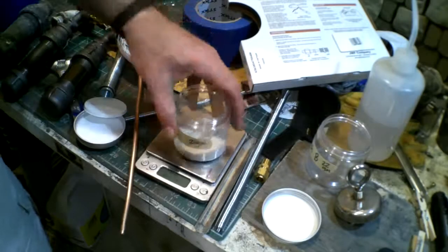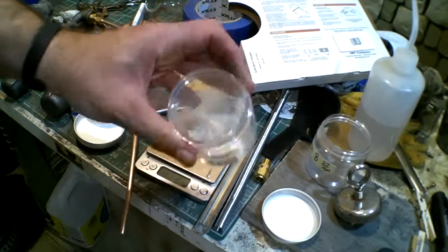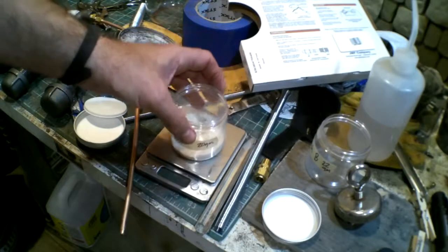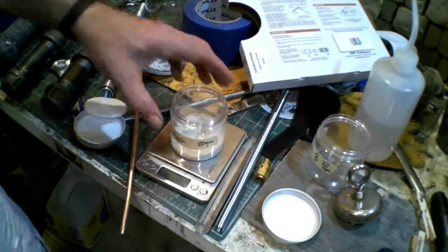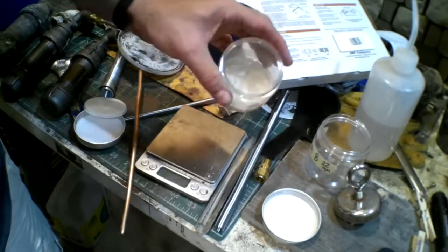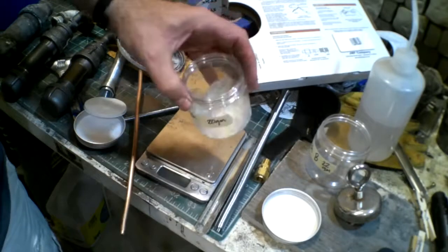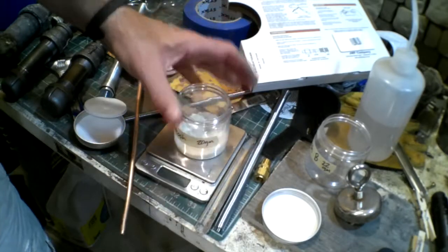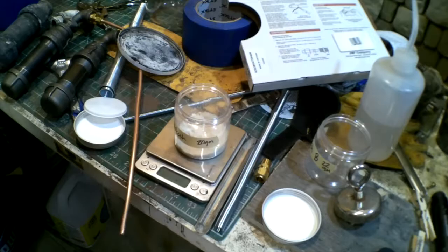So this is potassium carbonate. Its molecular weight is 138. Of that 138, there's two potassiums at 39 each, so that's around 80. So that's actually about 60% of the weight of this stuff is potassium. That means that of that 42 grams, there's, I don't know, 25 grams of elemental potassium in this mixture. There's 3 oxygens at 16 each and 1 carbon at 12. So what I need to do is make sure that I've got a significant excess of carbon in order to strip those oxygens off of that potassium carbonate.